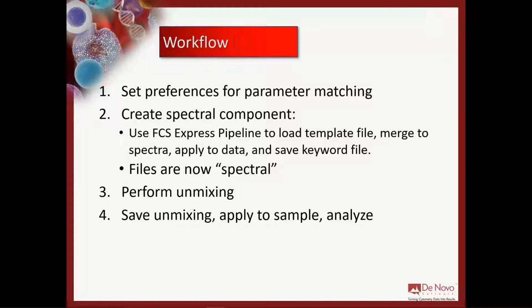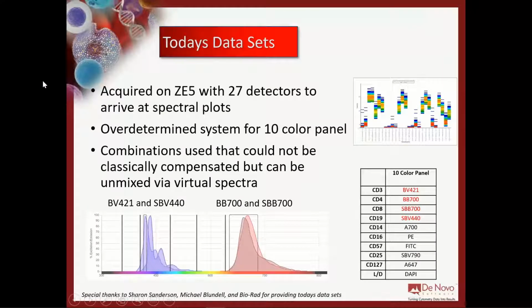And we're going to quickly go through how to use those data files to perform unmixing, how to save that unmixing and apply it to samples and analyze, right? So again, keep in mind that it's more of a high-level overview today of how these tools work, and we're excited to jump in with this.